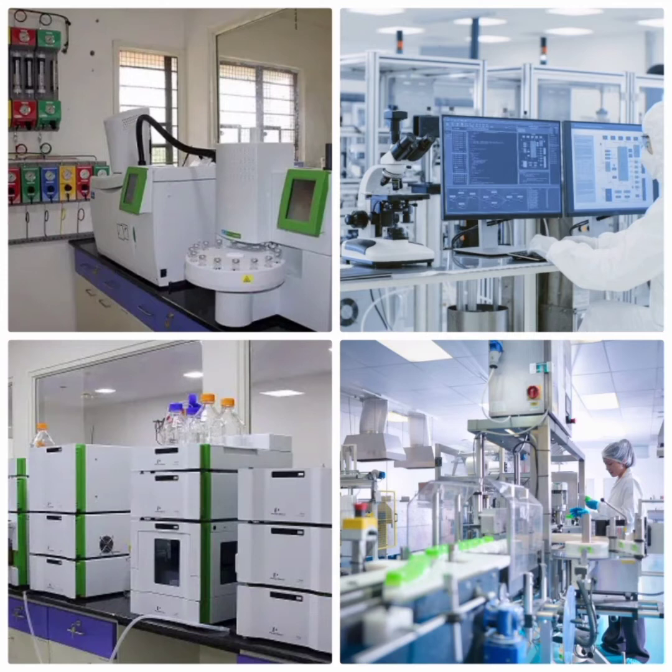If it comes to column packings, they offer a greater resistance to flow of liquids in comparison to gases. Gases also have a higher permeability through solid supports than liquids.